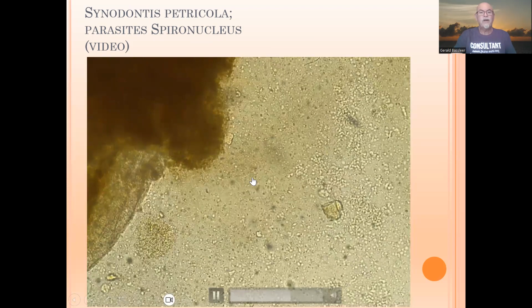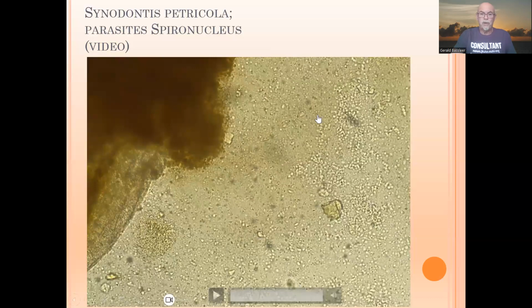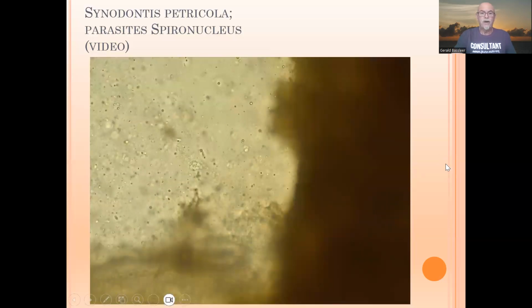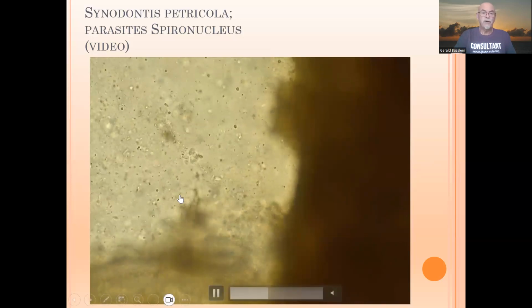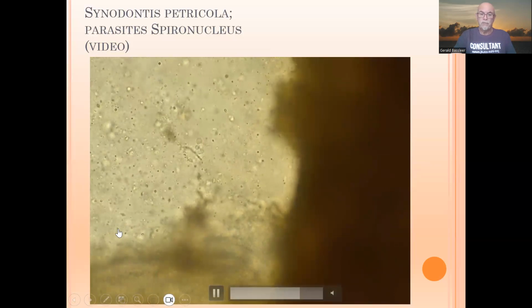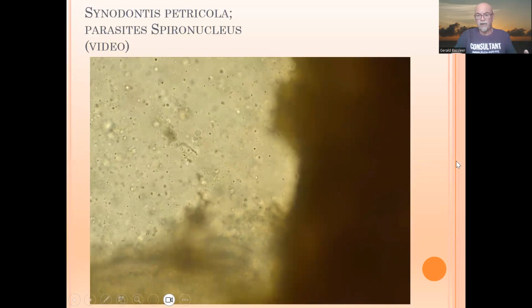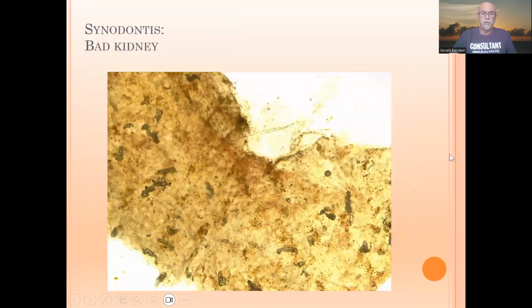Learn to detect that in the microscope. They are 50 to 100 times bigger than a bacteria. And they're moving around. Here we see that at 400 magnification. You see the tiny parasites moving around. Many of them are here. And particularly you find them in the excrements, in the intestine, where they cause damage to the intestine and cause problems in, how can I say, absorption of the essential feed nutrients.